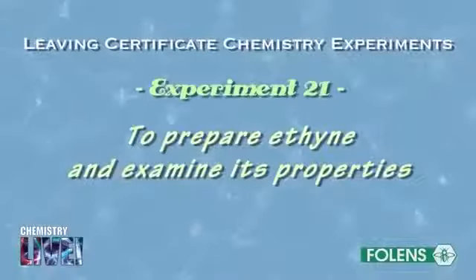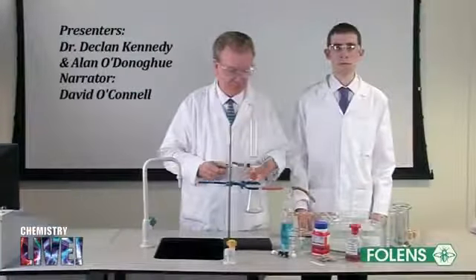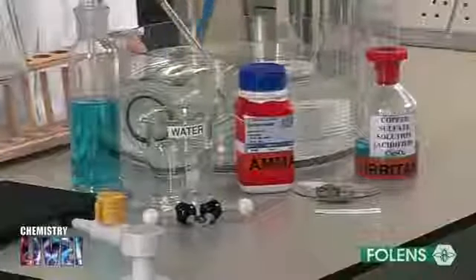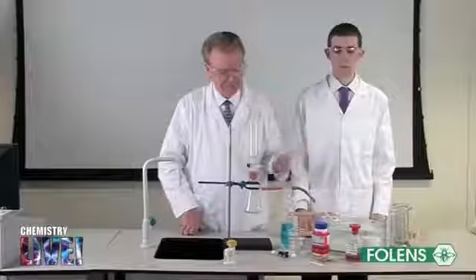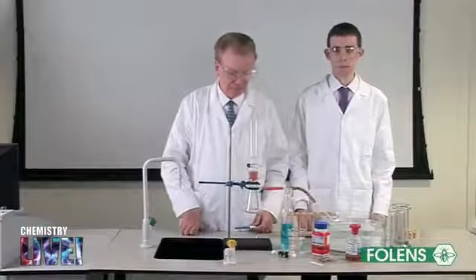Experiment to prepare ethine and examine its properties. Ethine, C2H2, is prepared by the reaction of water with a substance called calcium carbide, CaC2. Calcium carbide is also called calcium dicarbide.